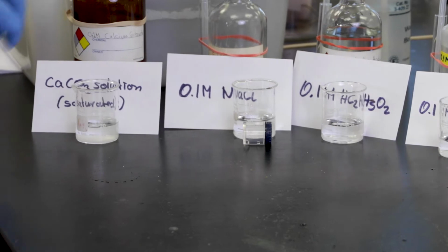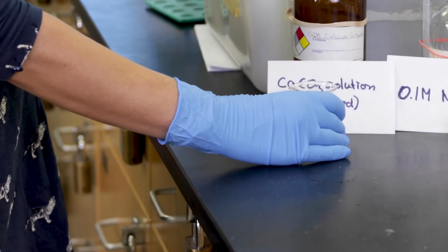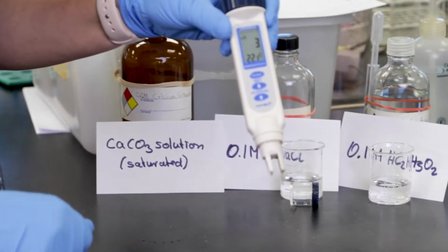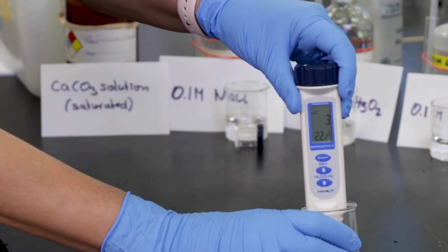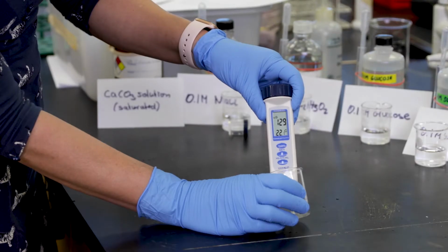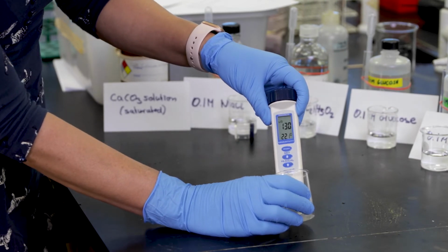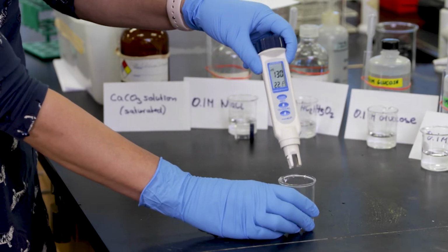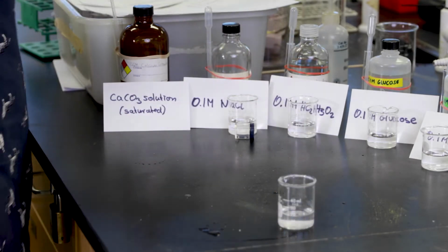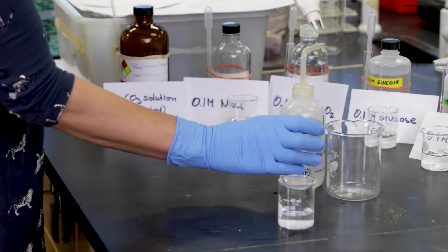Okay, so I have here a calcium carbonate solution which is saturated. You can see that it's saturated because it has some calcium carbonate on the bottom. So if I dip that in, we can read the conductivity, which is slightly higher. It's at 130 microsiemens. And then let's clean that. So that was calcium carbonate.